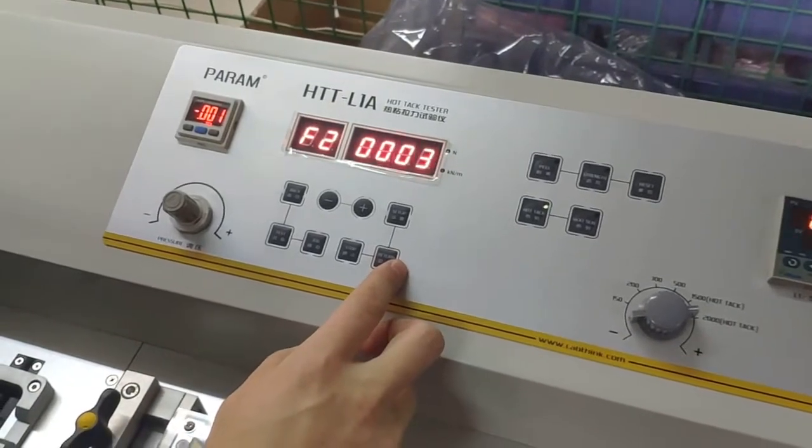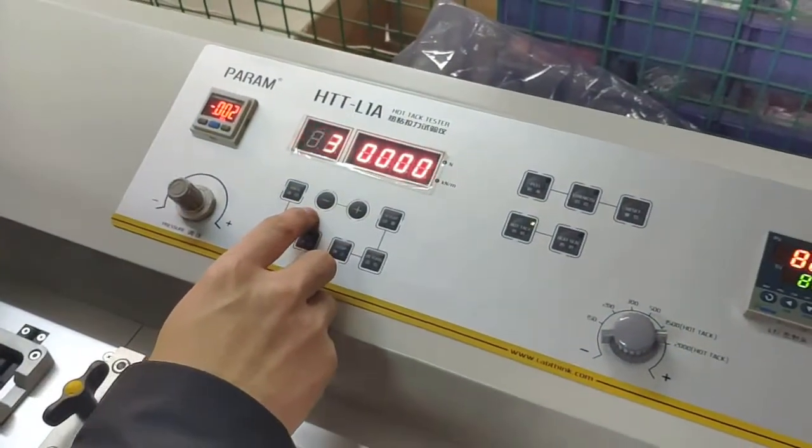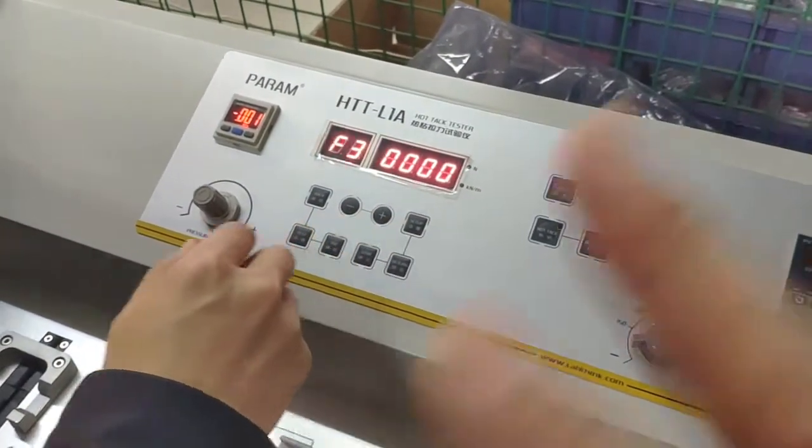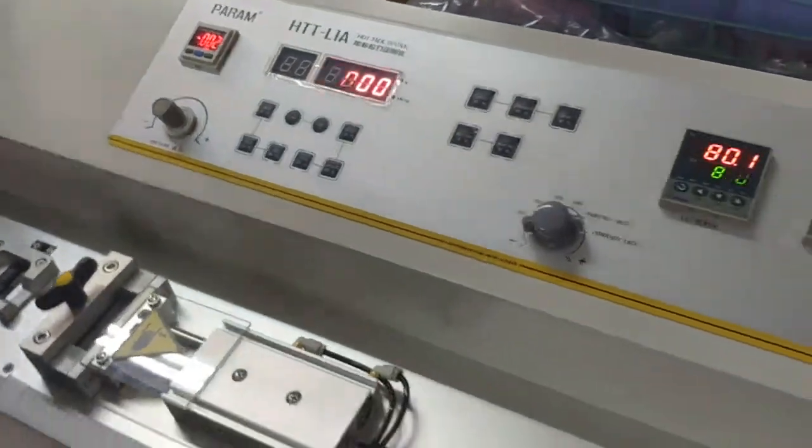F2 means the sample number. After F2, the F3 and other values you don't need to care anymore. All the other values we don't need to set.